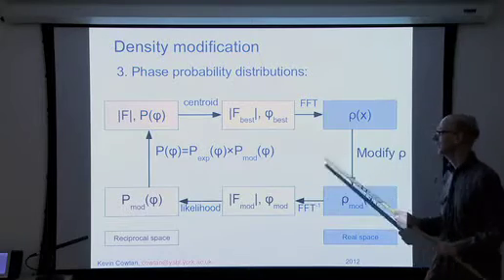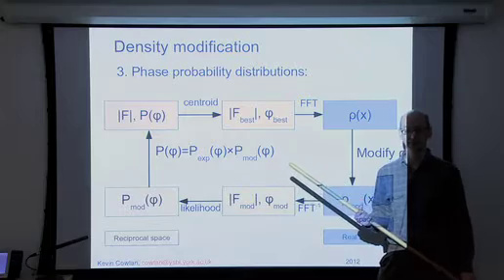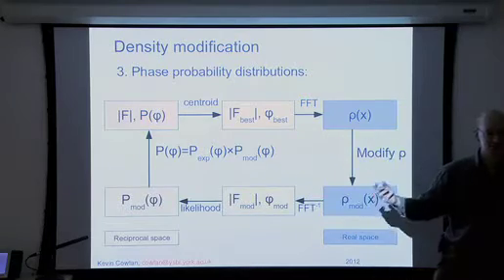OK, there's a fairly fundamental flaw in this approach, although it's better than what I've shown you so far. You can only multiply probabilities if the two probabilities are independent. So two die rolls, they're independent. So two 6s is 1 in 36. The probability of a father and son both having fair hair, they're not independent, so it wouldn't be the product.